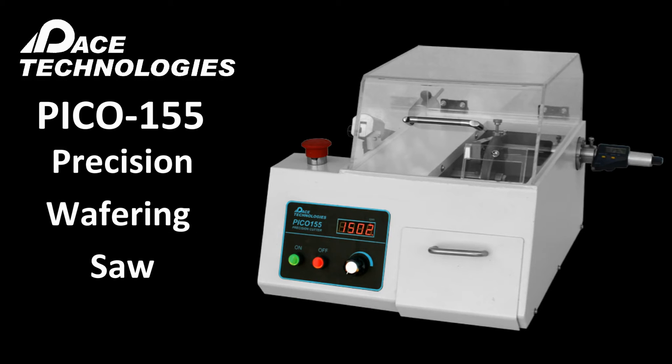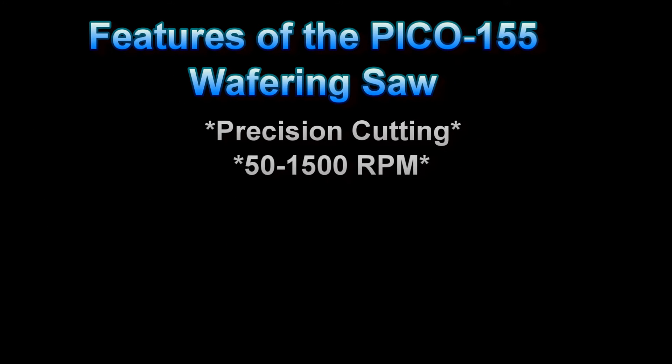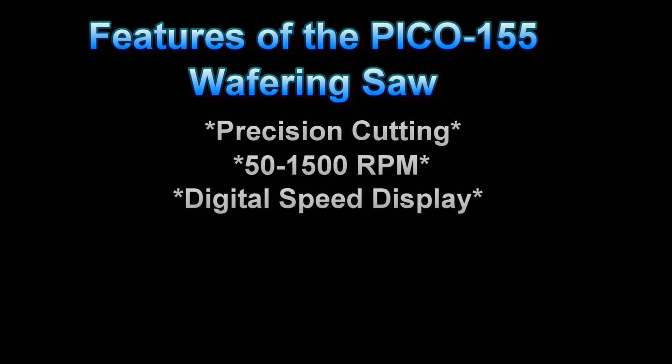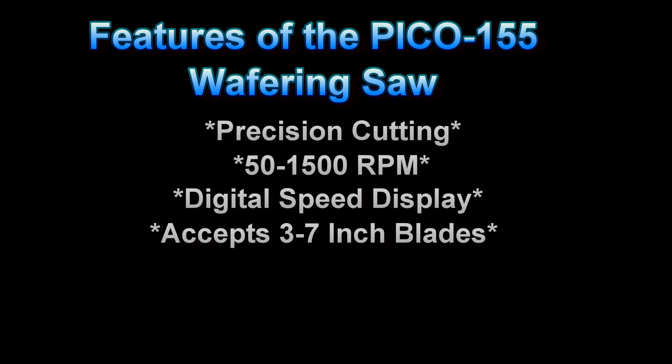The Pico 155 Wafering Saw is a very versatile and precise cutter. It features variable speed cutting from 50 to 1500 RPM with a digital display of the speed. Although the most common blade size used on the Pico 155 is a 6 inch diameter blade, it can accept blades ranging from 3 to 7 inches in diameter.